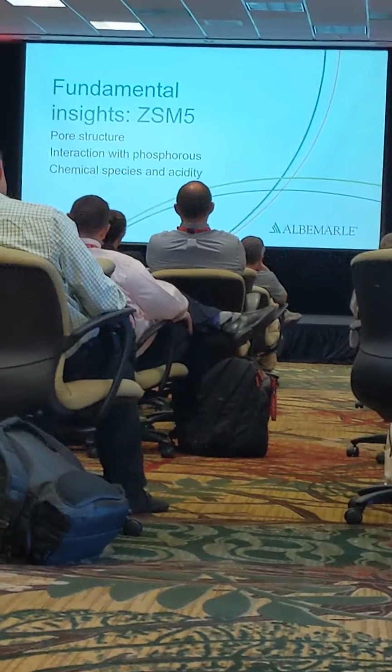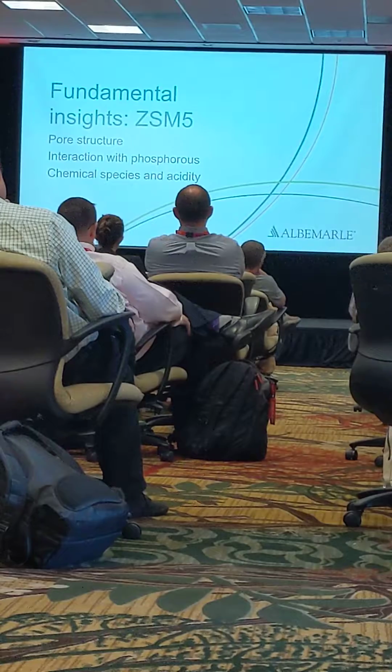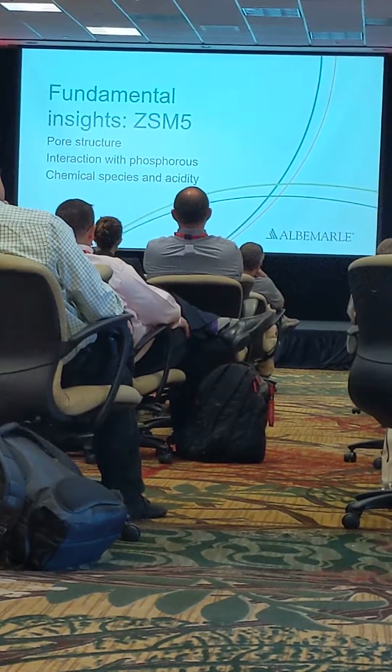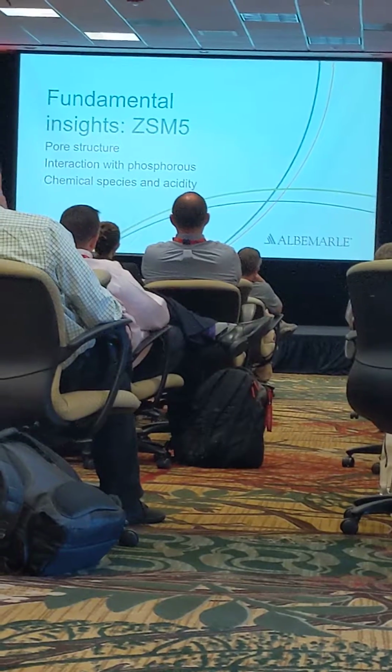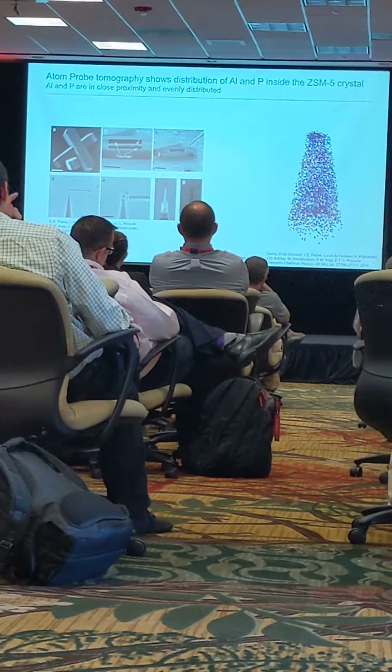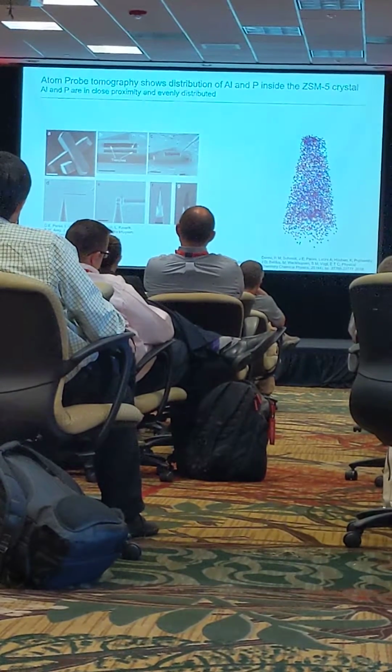I've got some really neat slides for you here, and I think they're going to show you at a very fundamental level how phosphorus changes ZSM-5. And of course, it's natural to understand that it's going to lead to new developments and new innovations. The first technique I want to talk about here is something called atom probe tomography.